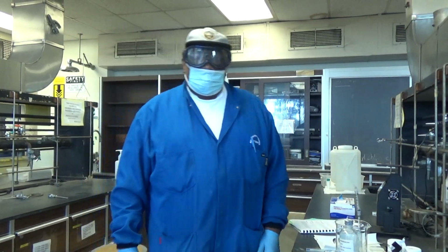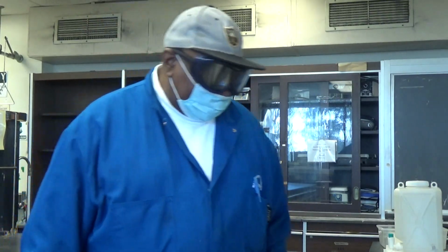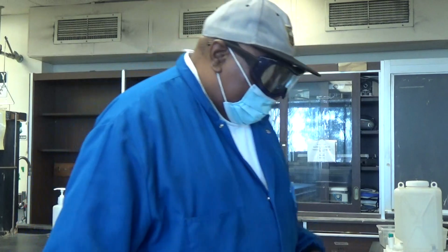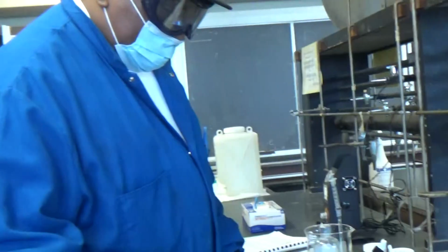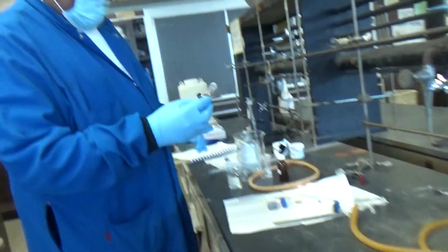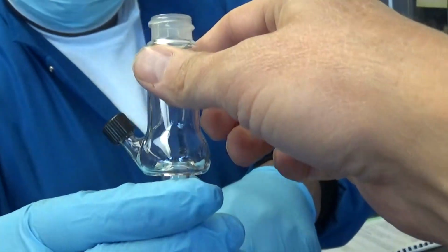So today we are going to perform the acid catalysis of pinacol. First we have to know what we need. We need a Hickman head, a Hickman still head with a side port. It's a Hickman head with a side port.